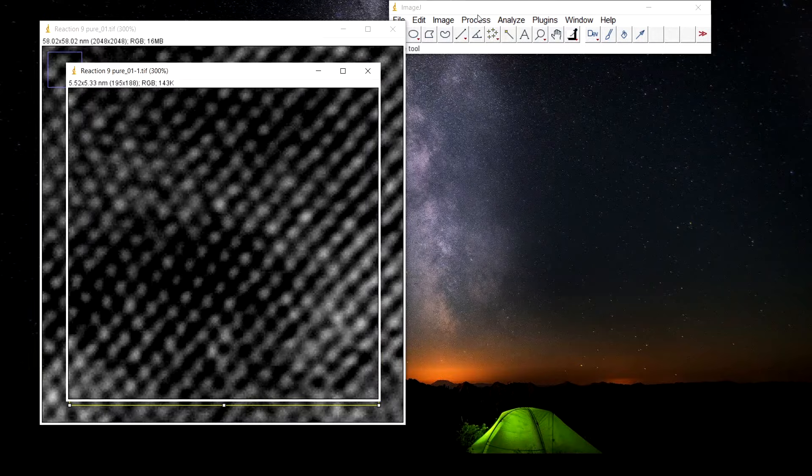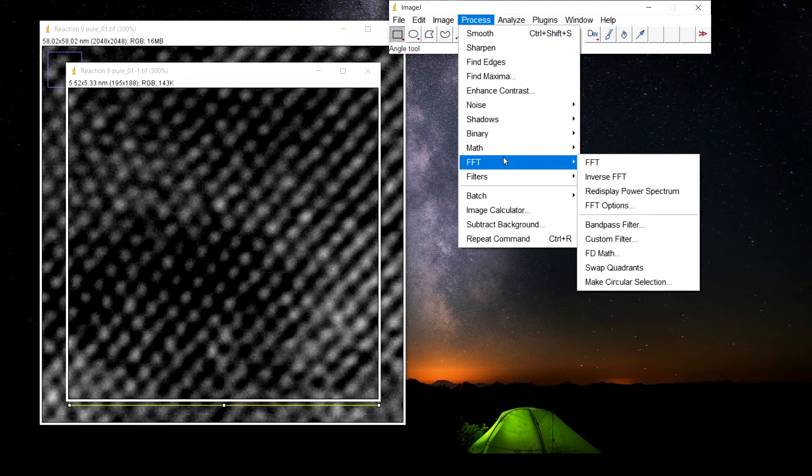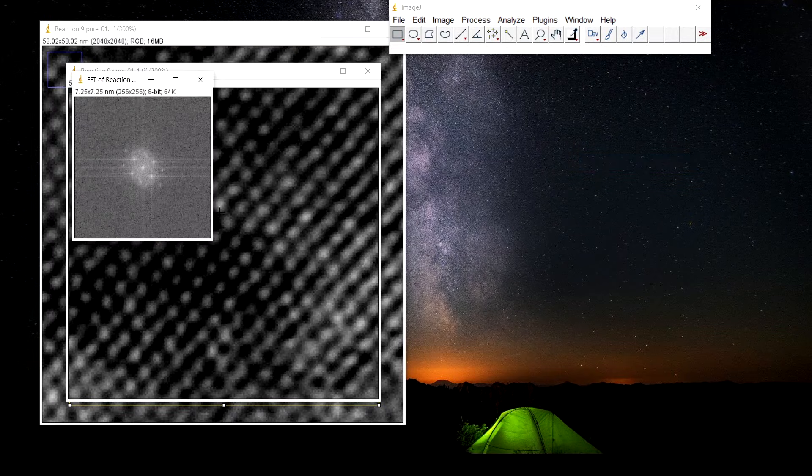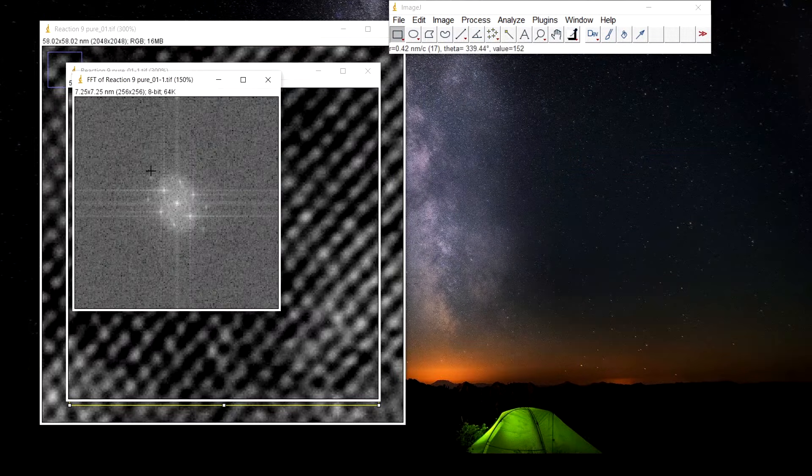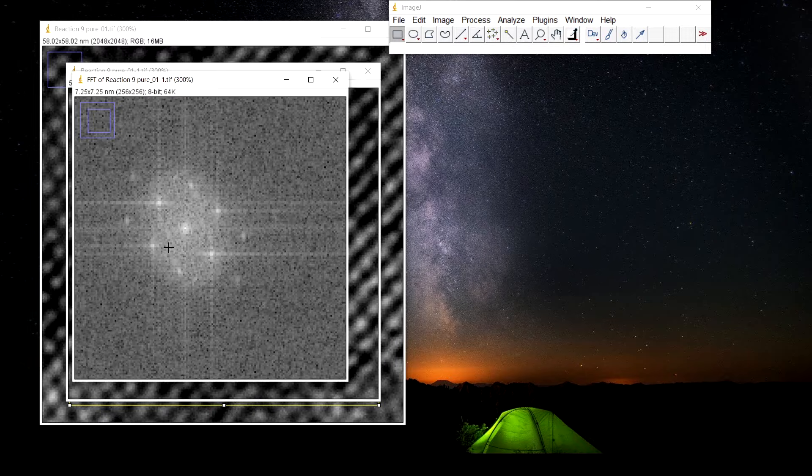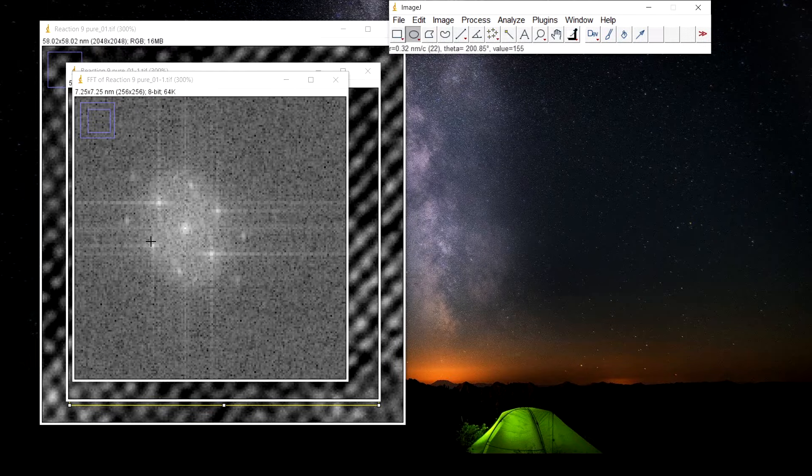Now go to process, FFT. Here, zoom in. We can see multiple dots, bright dots. We will select one of them.